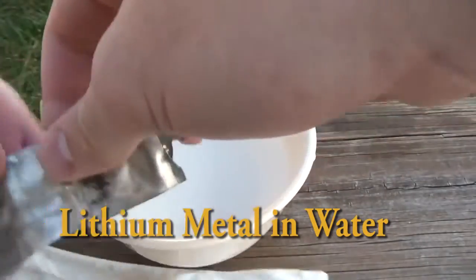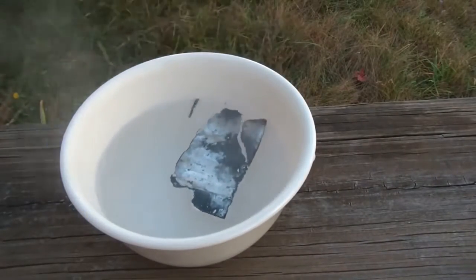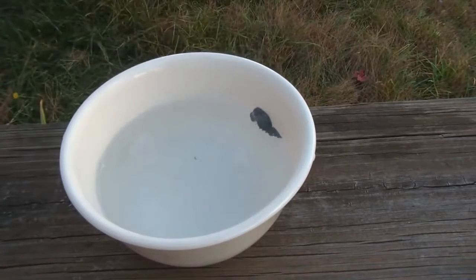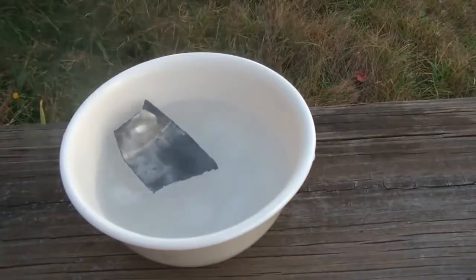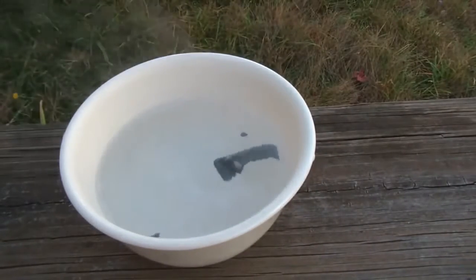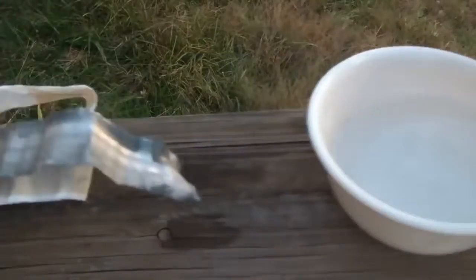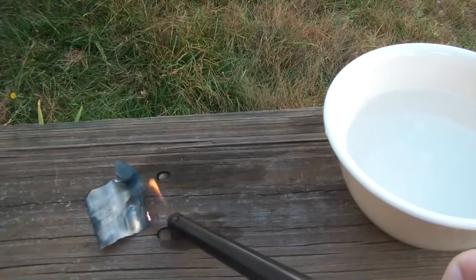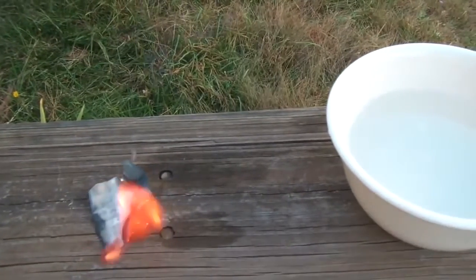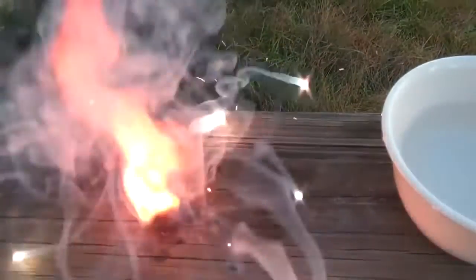We're actually just gonna take a small piece and throw it in water, see what happens. Actually boils. Now we're gonna try something different. Try to burn a small piece. Ooh.